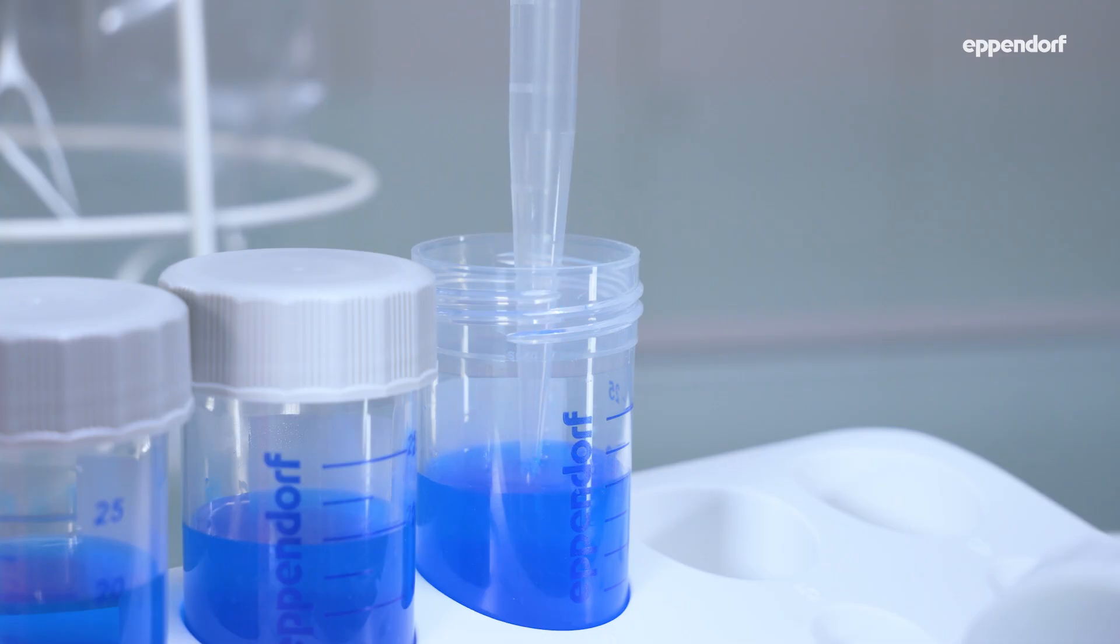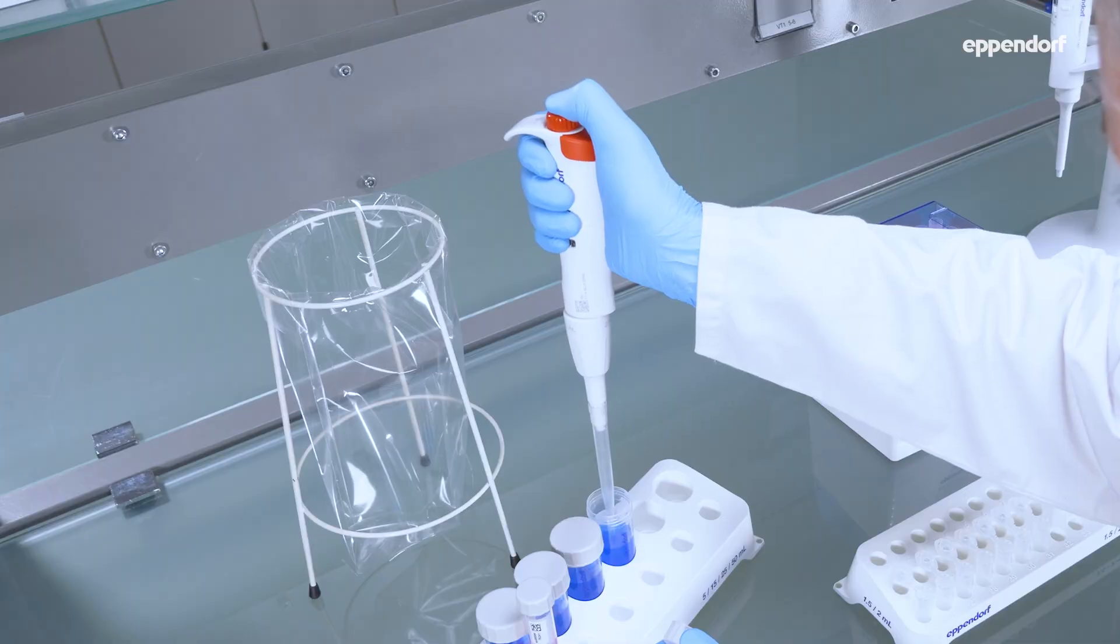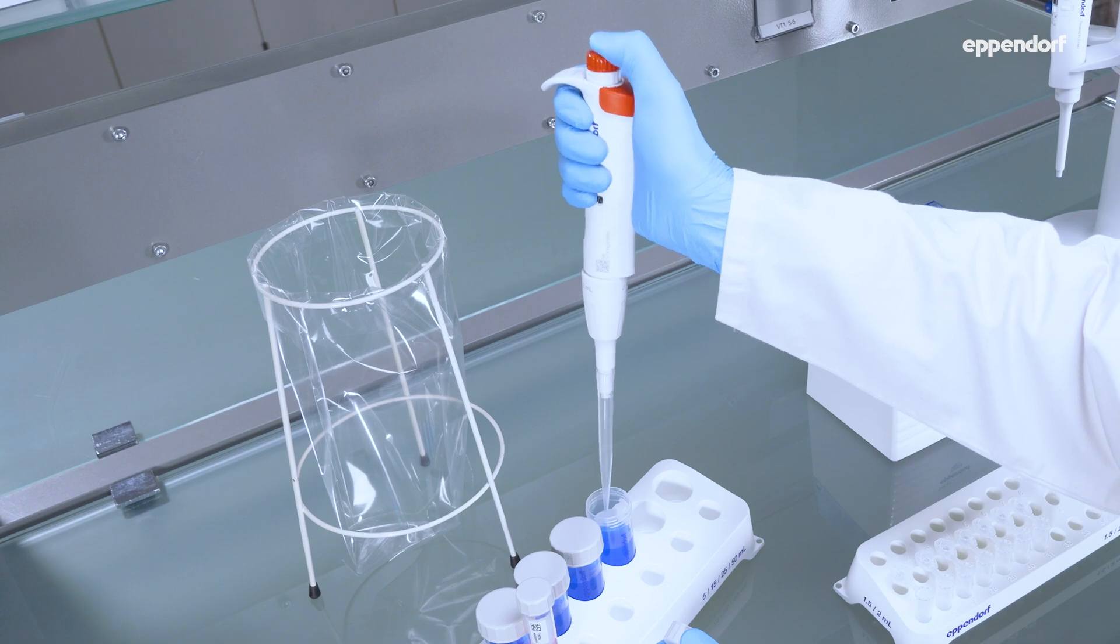Push the control button to the first stop again to dispense the liquid back into the source vessel and pre-wet the inside of the pipette tip. Perform at least three pre-wetting steps to maximize precision when using a new pipette tip.